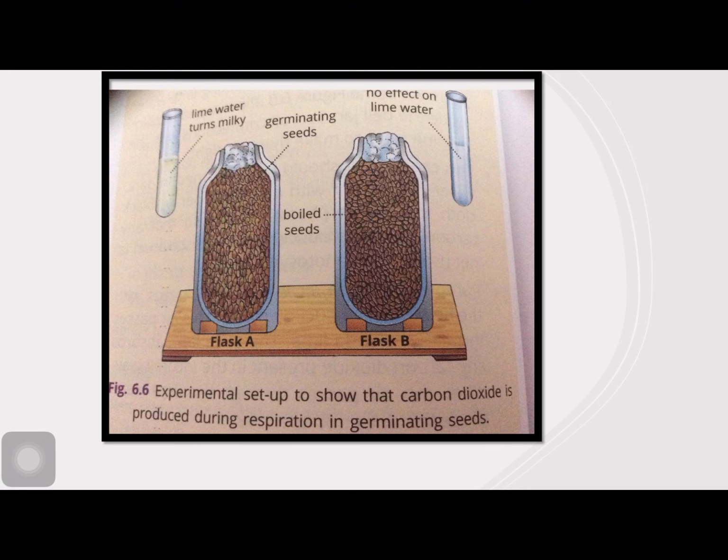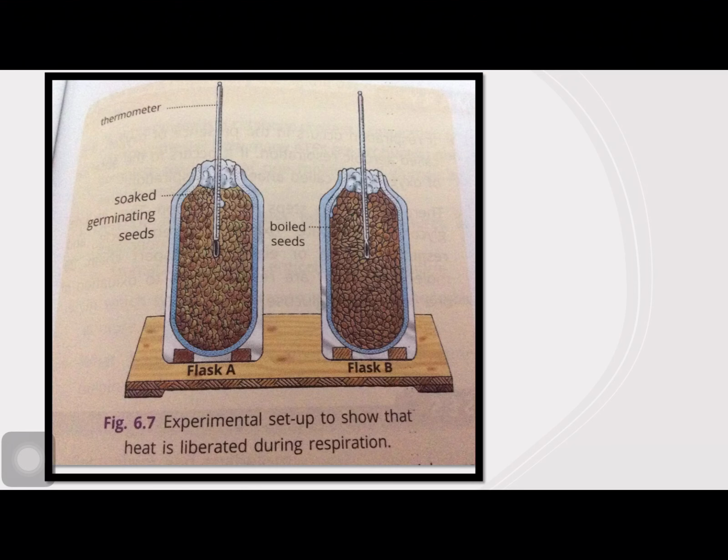Now we will move on to the last activity of today, that is how heat is evolved during respiration, which we will prove. Now the experimental setup to show that heat is liberated during respiration: what are the things we have taken in this experiment?